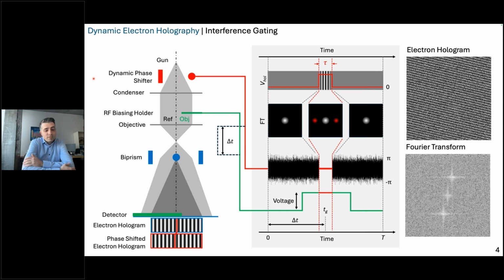You then can call it a microwave cavity and go to gigahertz, but basically this is what we are using at the moment and experimenting with. A rather simple aperture holder, which will give us the possibility to go up to gigahertz. And by this, we are currently in our setup realizing time resolutions down to 2 or nearly 1 nanosecond.